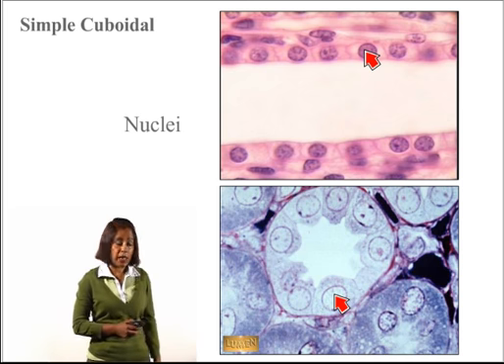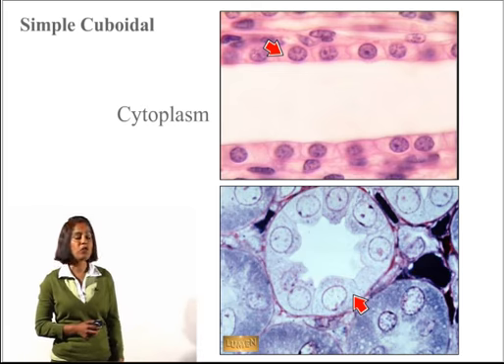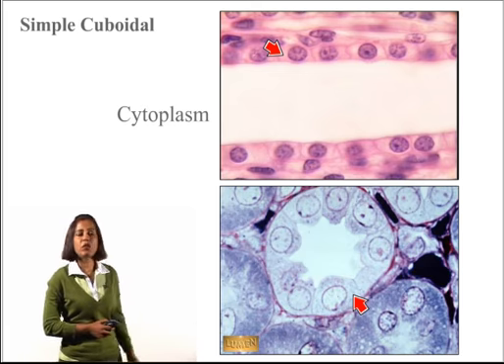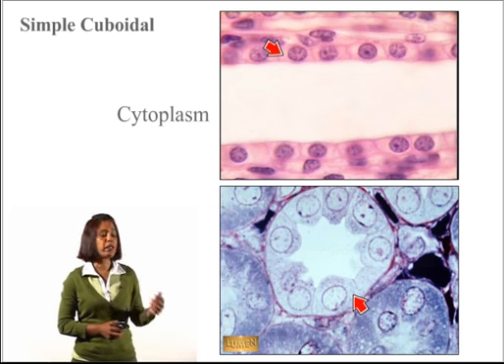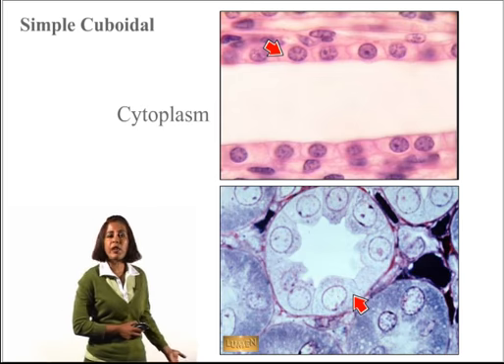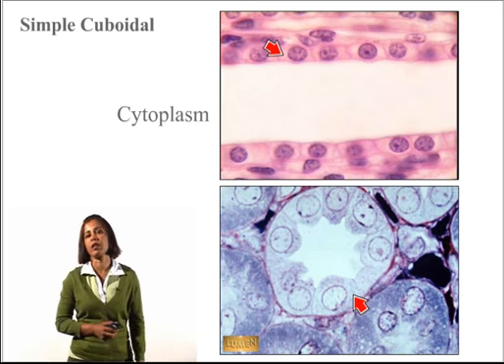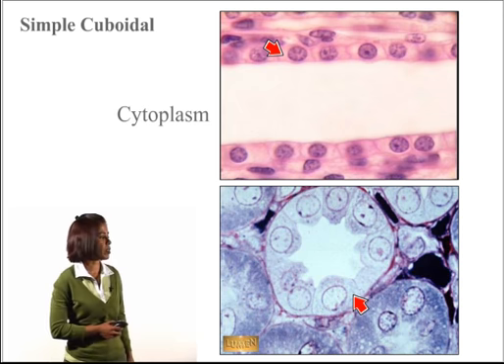Surrounding the nuclei, in this you can see cytoplasm. This was something you did not see in the previous image, and this cytoplasm is present on either side of the nucleus, and very little cytoplasm actually is present above the surface of the nucleus, on top of the nucleus.